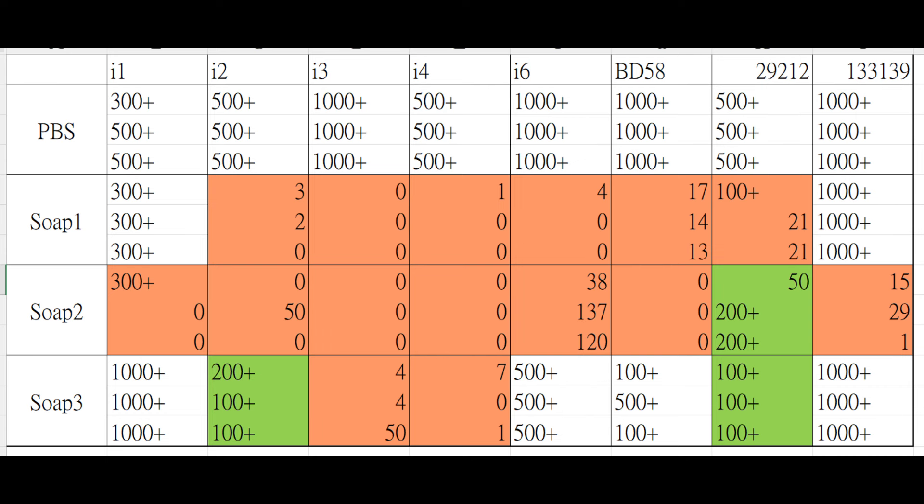And all the bacteria used in this test is all linked to personal hygiene. So there is no one soap that kills them all.